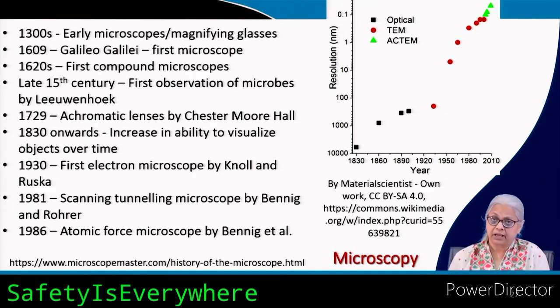So we can now visualize molecular structures, we can visualize DNA, molecules, proteins, all of these can now be visualized very easily. The resolution of optical microscopes, as I've already said, under fluorescence microscopy, has now reached around 20 nanometers. So now we are somewhere in this region with optical microscopes. It's not limited to 200 nanometers. What you're seeing over here is about 200 nanometers, but we are now at the level of 20 nanometers with light microscopes.